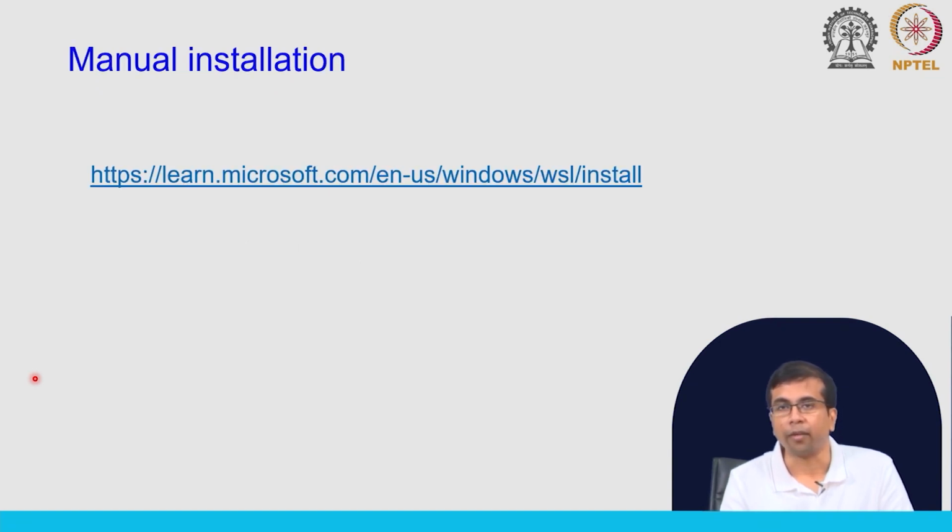One of the things I wanted to discuss: maybe you want to access remote servers, whether you are in Windows or Linux, because some of the tasks of NGS analysis will require access to a computational server which has more memory, more storage, etc. Some of the tools that we will use later on require a lot of memory, and you cannot run them just on your desktop or laptop.